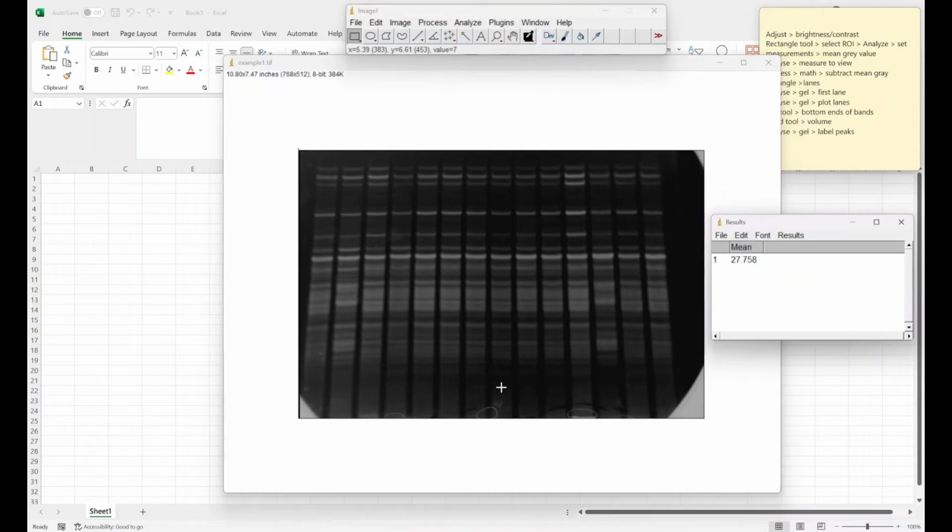Using an adaptive background removal technique such as rolling ball, which we present in Phoretix 1D, would allow you to compensate for both of these scenarios. As it stands now, I'm only using standard ImageJ. There are plugins available potentially that could solve this. But at the moment, I'm going to have to assume an even background level, which in real life is not always the case.